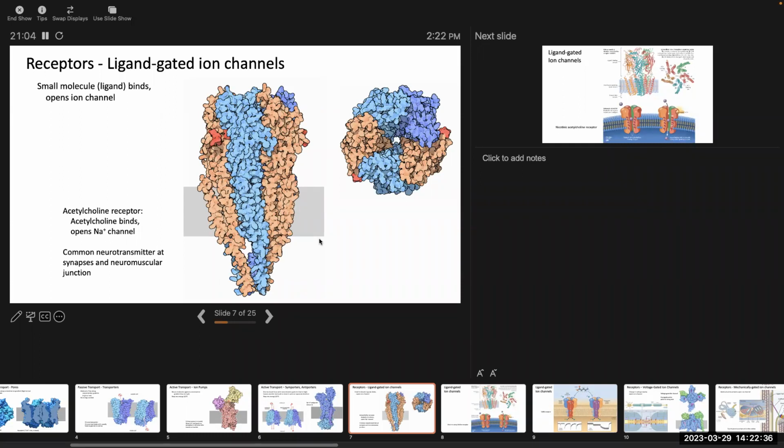Yeah, I tried to demonstrate a little bit. The first day that I introduced Chimera, as I was showing some of the lighting controls, I said I've experimented with using an ambient light setting that can kind of replicate it a little bit, but you really have to tweak the lighting settings, the shininess and lighting settings in Chimera to try to replicate this.